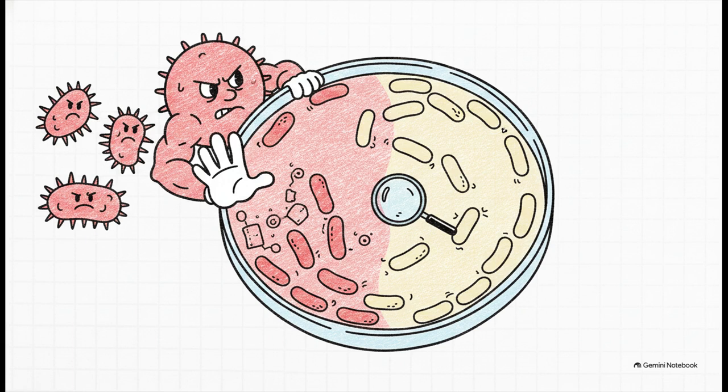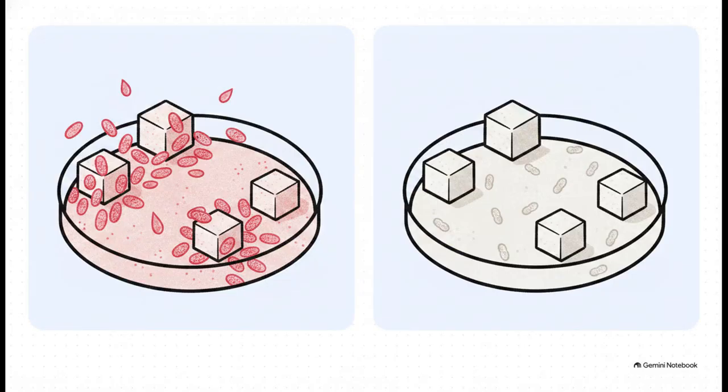The bouncer aspect inhibits gram-positive bacteria, allowing gram-negative enteric, or intestinal, bacteria to grow. Then the lie detector aspect differentiates those gram-negative survivors based on whether or not they can ferment a specific sugar called lactose. And this brilliantly illustrates the true power of differential media. If the bacteria ferment lactose, they produce acid, and the indicator in the MacConkey agar turns the colonies a bright, unmistakable pink or red. This points the detective right towards suspects like E. coli or Klebsiella.